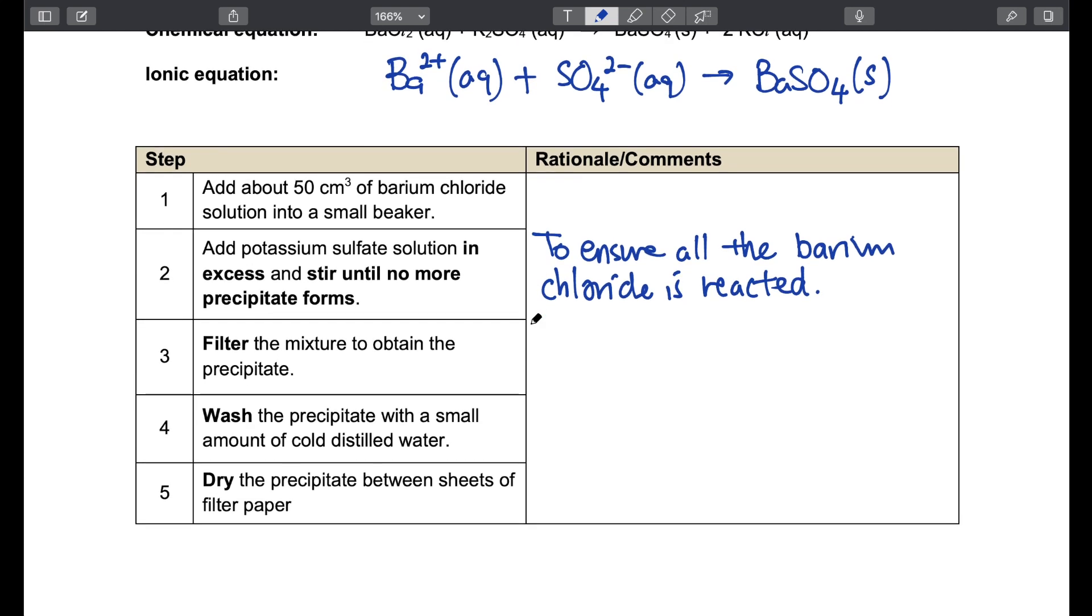The next step, we are going to filter the mixture to obtain the precipitate. Then wash the precipitate with a small amount of cold distilled water. This step helps to remove any impurities. And we dry the precipitate between sheets of filter paper because filter paper is highly absorbent.